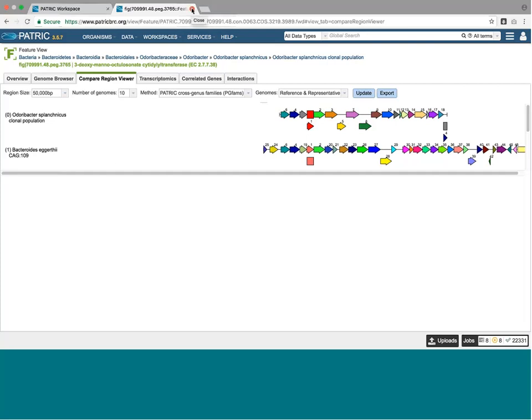So we would go out and take the contig out of the FASTA file for this bin, throw it in the other bin, run the two FASTA files through the annotation service again and see if we get better genomes.